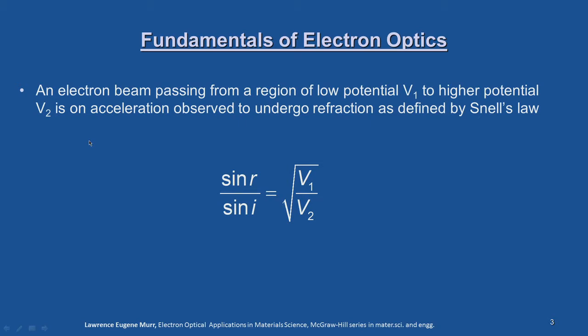We will first discuss electrostatic lenses, because electrostatic lenses were the first used in the electron microscope, and their design and behavior were studied first. Only then was this adopted for electromagnetic lenses. So, let us review some of the primary features or theoretical concepts underlying these electrostatic lenses.